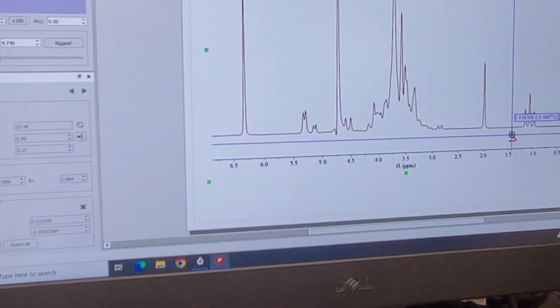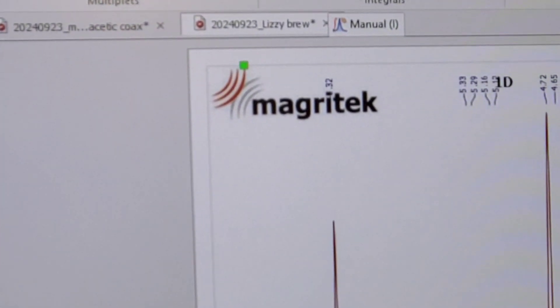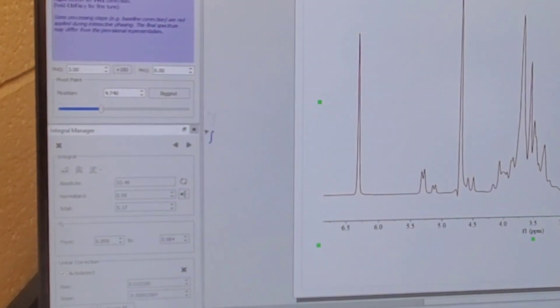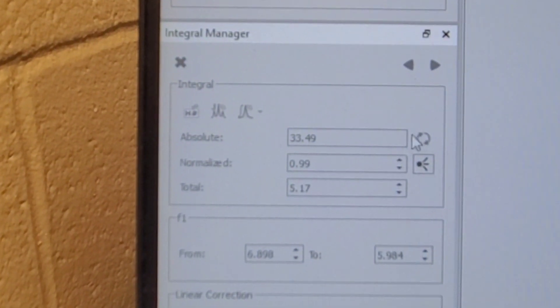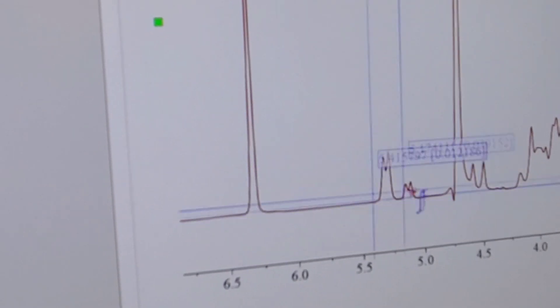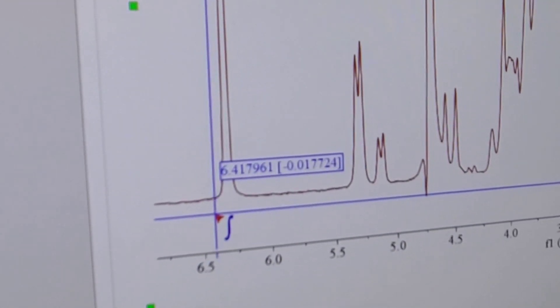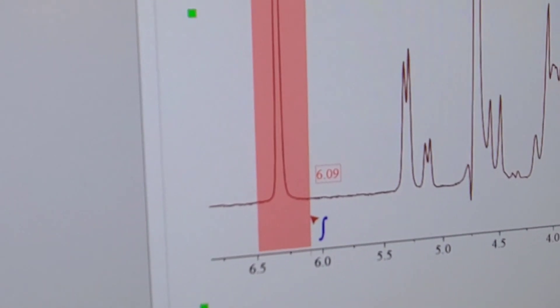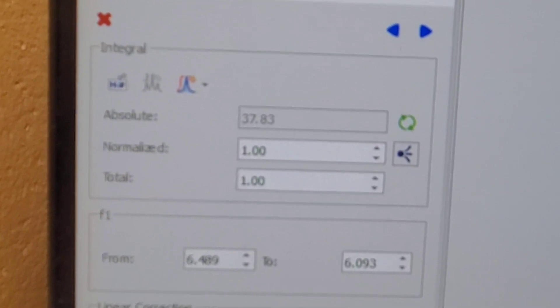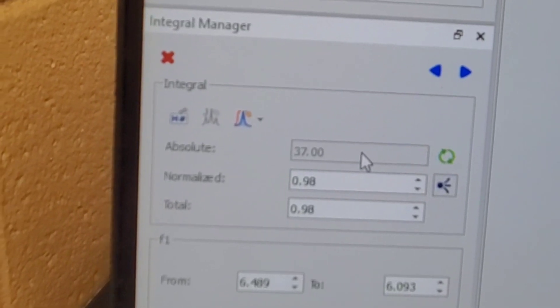To get quantitative data we need to integrate the areas under these peaks. Go up to the Analysis section, click on the manual integration tool — the one with the little green ball. We also have the linear correction tool down here, which is important. To integrate, take the cursor — which shows the integral sign — and for the maleic acid peak, start just before the peak and drag to just after it, baseline to baseline. Then hit auto detect for baseline correction, which brings the integral down slightly — in this case to about 37 units for the internal standard.